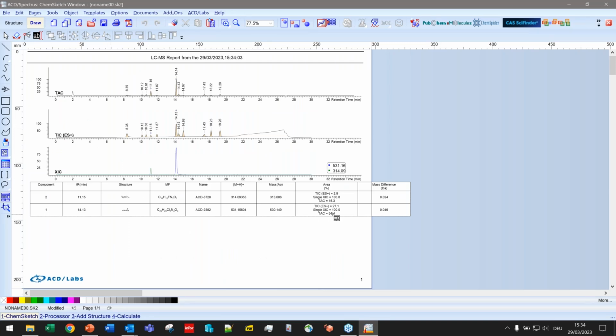So we're getting the table of components, and you can see one problem that you might observe every now and then, and that is that a reporting object is too big for the page. So now you have different ways of how to fix it. You can either change the width of each column. You can unselect columns if you want to. That's another good possibility. Or you can select which columns to report specifically in the reporting options. Now, what we have done for this object here, we said keep the options from processor. So let's go ahead and test this.